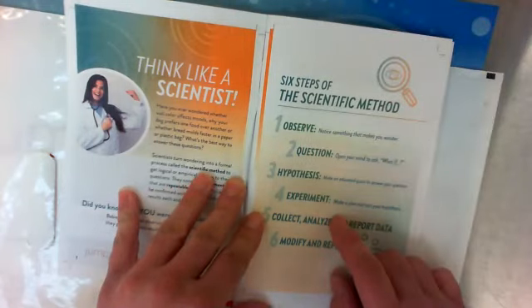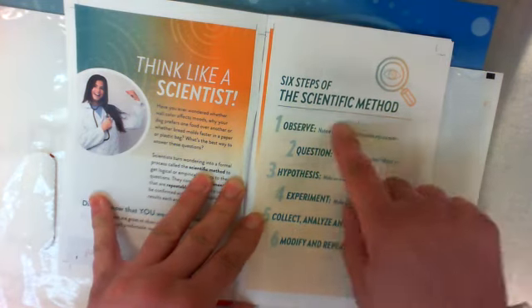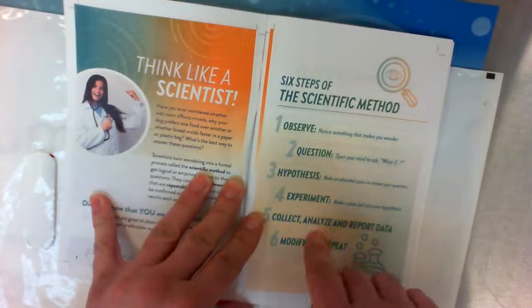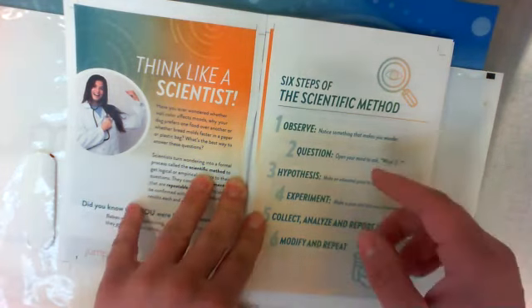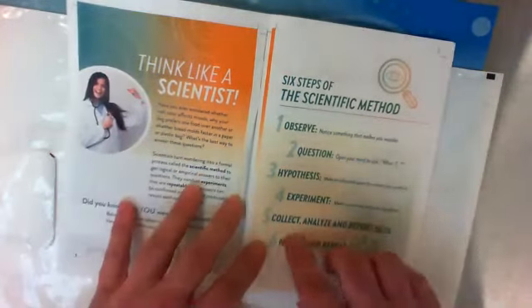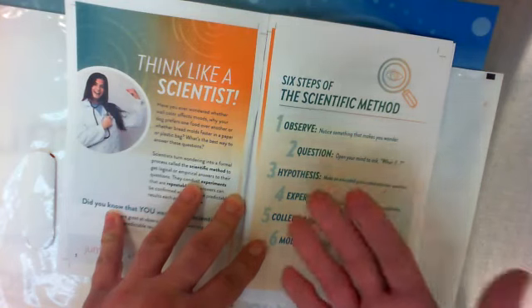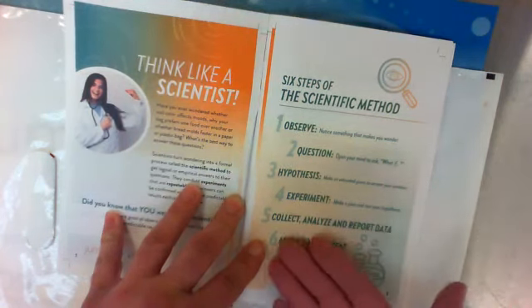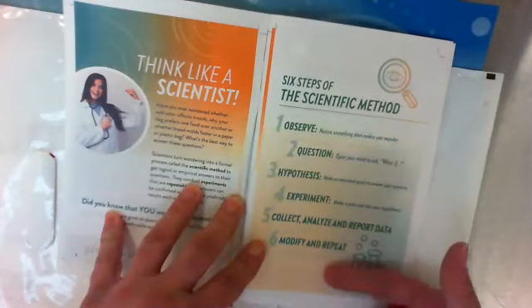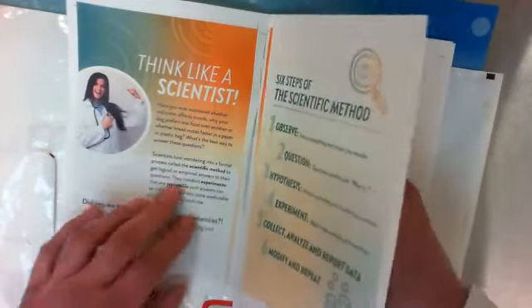Do the experiment, dissect down. Did you find lungs? If you didn't, then it has to be breathing with another organ. Find that organ, collect, analyze, and report your data, and then tweak it. So maybe you figured out that it doesn't breathe with lungs, it has to breathe with something else, which we'll talk about later. Next time you are in science class and they dissect a frog, well, now you have two breathing organs. So it could be a lung or it could be this other organ. Ask yourself, modify, repeat, and see if you can find it. So what's interesting is the frog actually can breathe with its skin. Just a spoiler alert. Next.